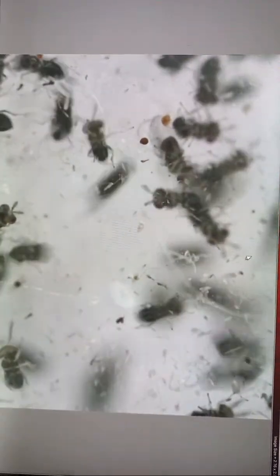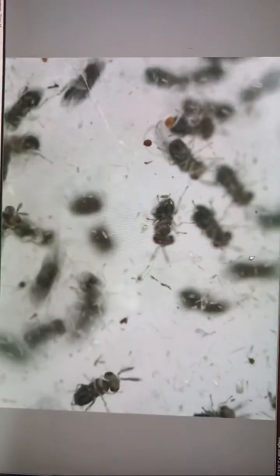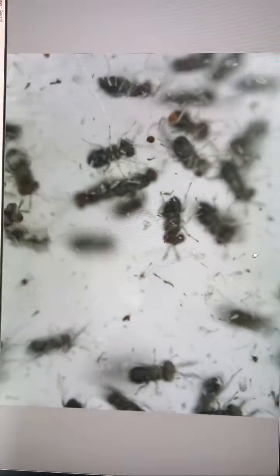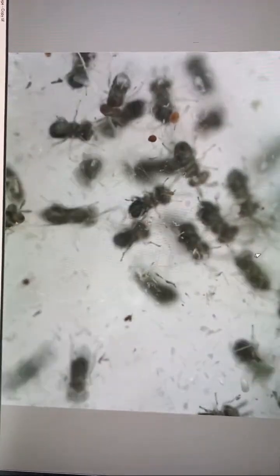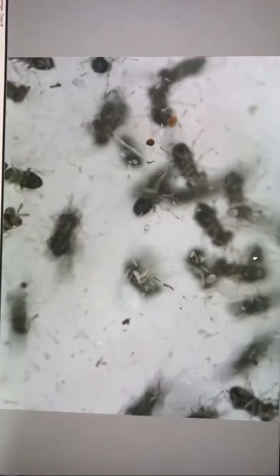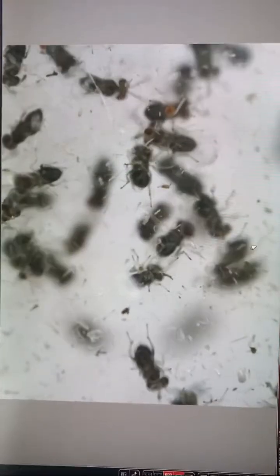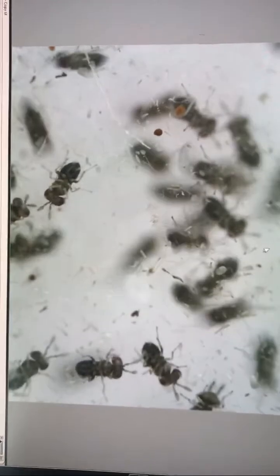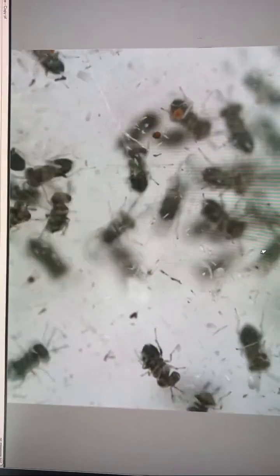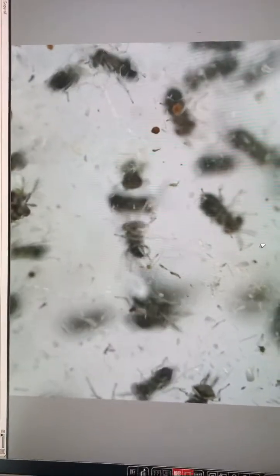We're moving a little bit slowly here because computer is freezing a little bit, cannot transmit the picture of this insect immediately from under the microscope to computer. That's why picture is a little bit freezing. But it's normal because it's quite difficult to take a very precise picture of these tiny insects because it needs to take focus upper side and down side, and size of them is very small. As I said, 0.5 millimeter.